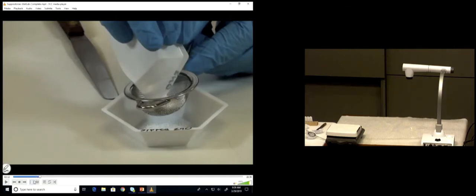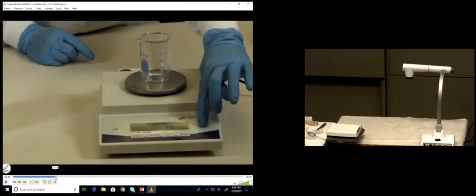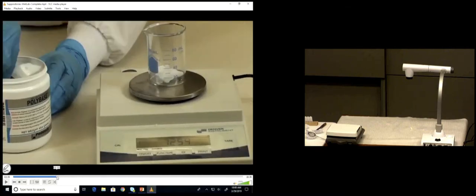Not a big deal. So you go get your 1 gram of zinc oxide and put it in a weigh boat. Then here we are putting our 2 beakers. Put a circle or note this, whatever step it is there. 100 milliliter glass beaker. See that glass beaker in the video? Those are the 2 beakers you need to use. Are they small 100 milliliter glass beakers?